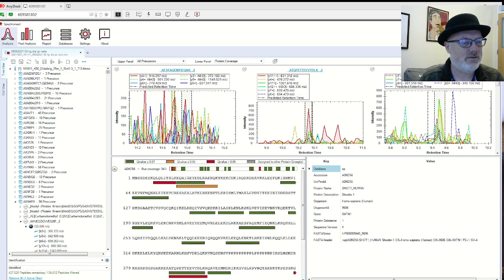And if you look at the bottom here, it's going to go through and recalculate a lot of its stuff. So let's see. My hypothesis is that data that looks like this will disappear because I believe this might be imputed, and good data will remain. So let's see if I'm right about that. I'm not exactly sure.